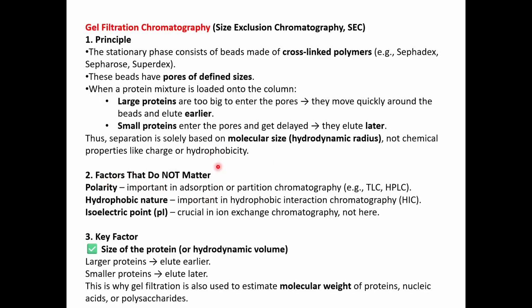The factors that do not matter here are polarity, hydrophobic nature, and isoelectric point. Theoretically, polarity is important in adsorption and partition chromatography like TLC and HPLC, and hydrophobic nature is made use of in HIC and not in gel filtration.